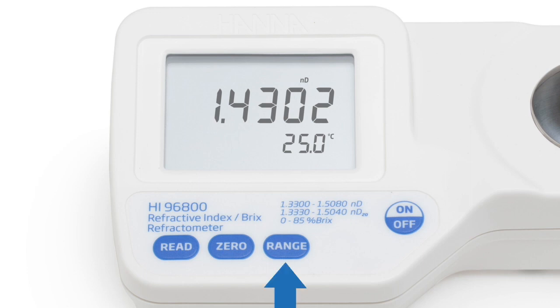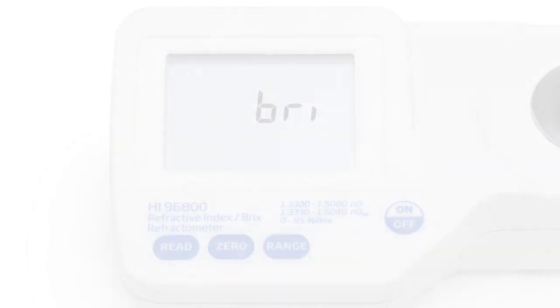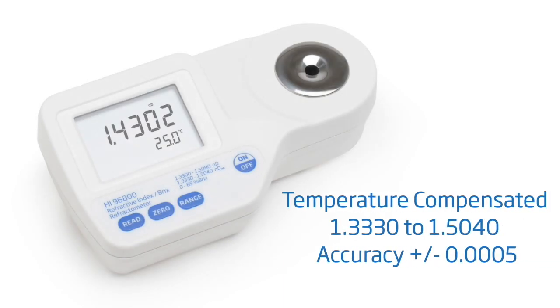The range key can be used to switch between temperature compensated, non-temperature compensated, and percent brix readings. The appropriate tag for the range selected will be displayed. For temperature compensated readings, the refractometer will display results between 1.3330 to 1.5040, with an accuracy of plus or minus 0.0005.